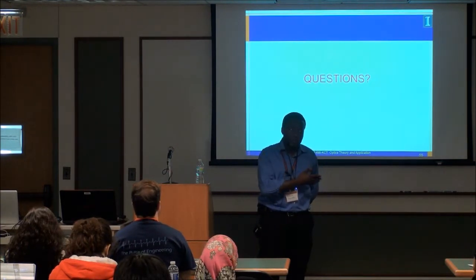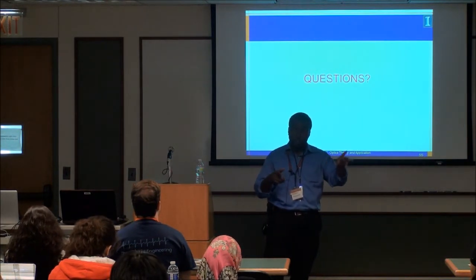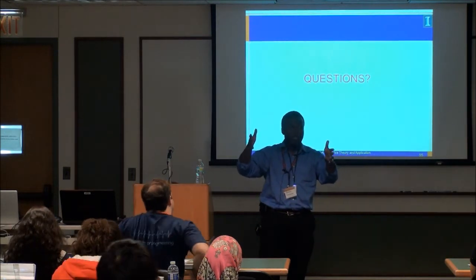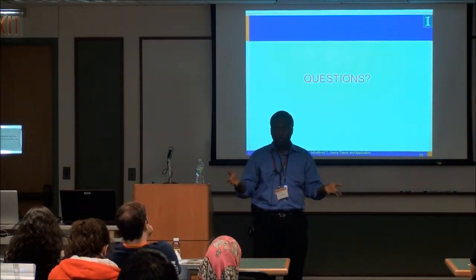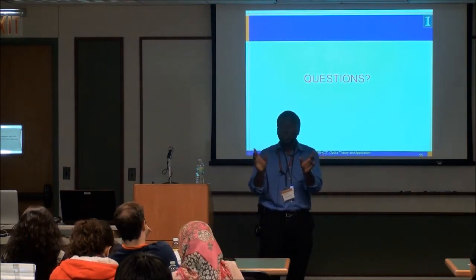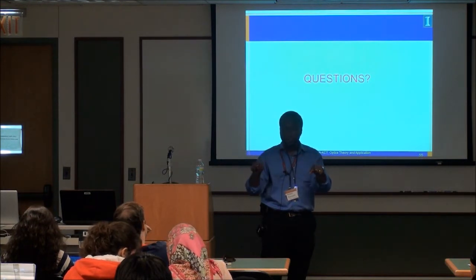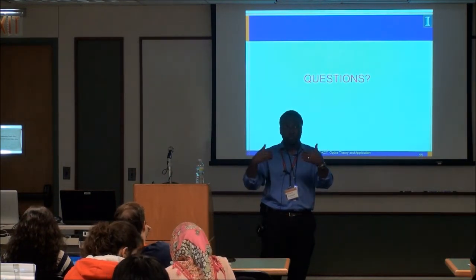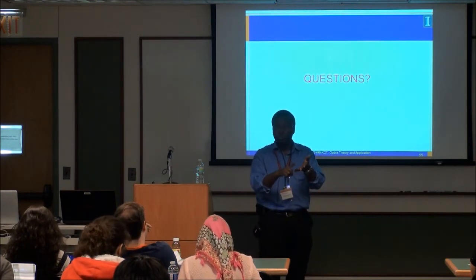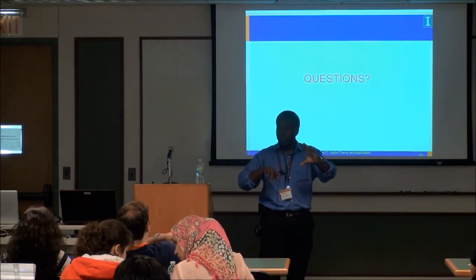So one of the things, for instance, that we do in my lab, I put up the equation earlier that relates the polarization density to the second order field. This was the chi 2. If the medium itself is anisotropic, which is what you'll have with collagen, then P and E are no longer parallel. And they're related now through these tensor element relationships. If you're doing non-resonant excitation, you assume certain types of symmetry. So your chi 2 becomes a matrix with tensor elements.